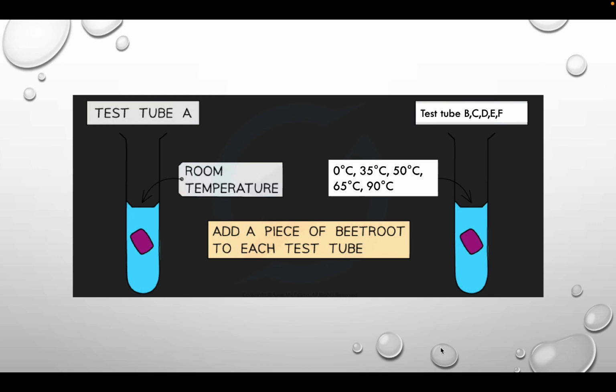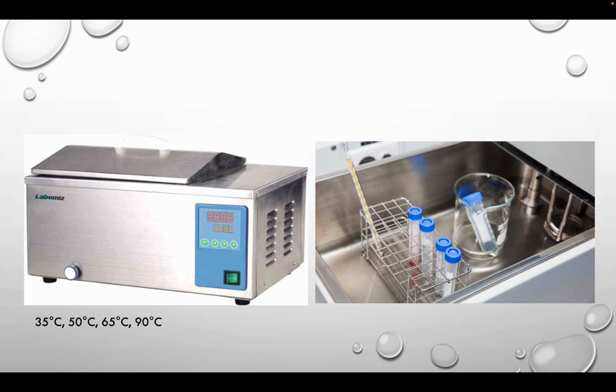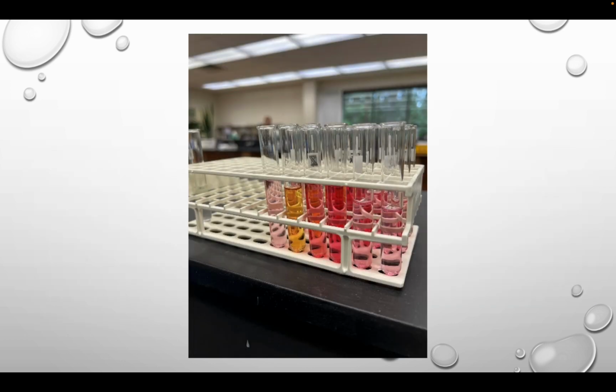Thank you, ARYANA. After preparing the test tubes, we put them into water baths. But before that, we set up the water baths at 35 degrees, 50 degrees, 65 degrees, and 90 degrees. And besides that, we set up an ice bath for 0 degrees.